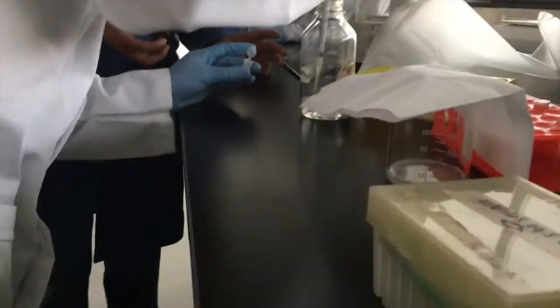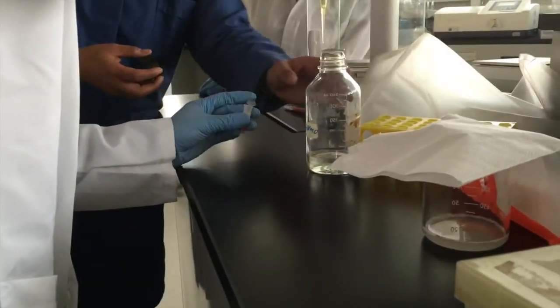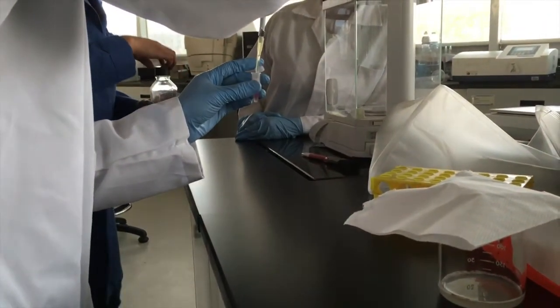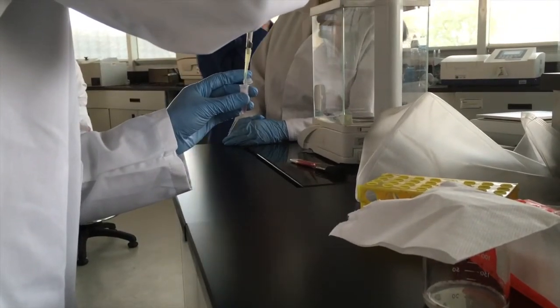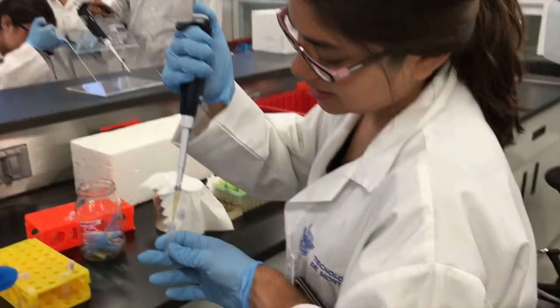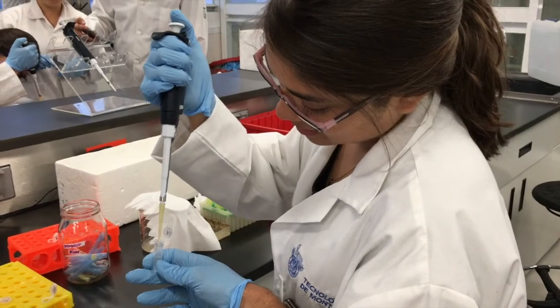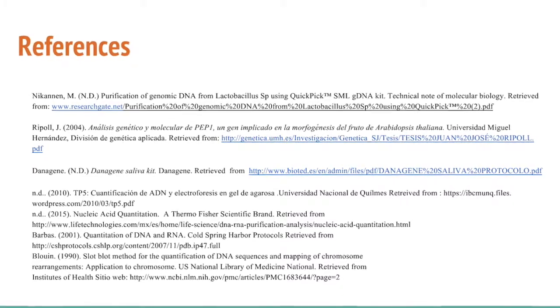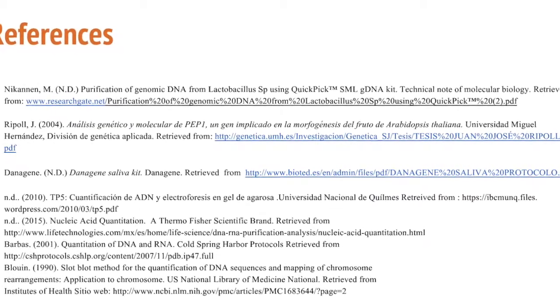The nature of the sample has to be taken into account, whether it is eukaryotic or prokaryotic, since each type of cell requires a distinct protocol and therefore different reagents. From the diluted sample, the value of absorbance will be measured at different wavelengths against a blank sample, and then the concentration and total quantity of nucleic acids can be obtained.